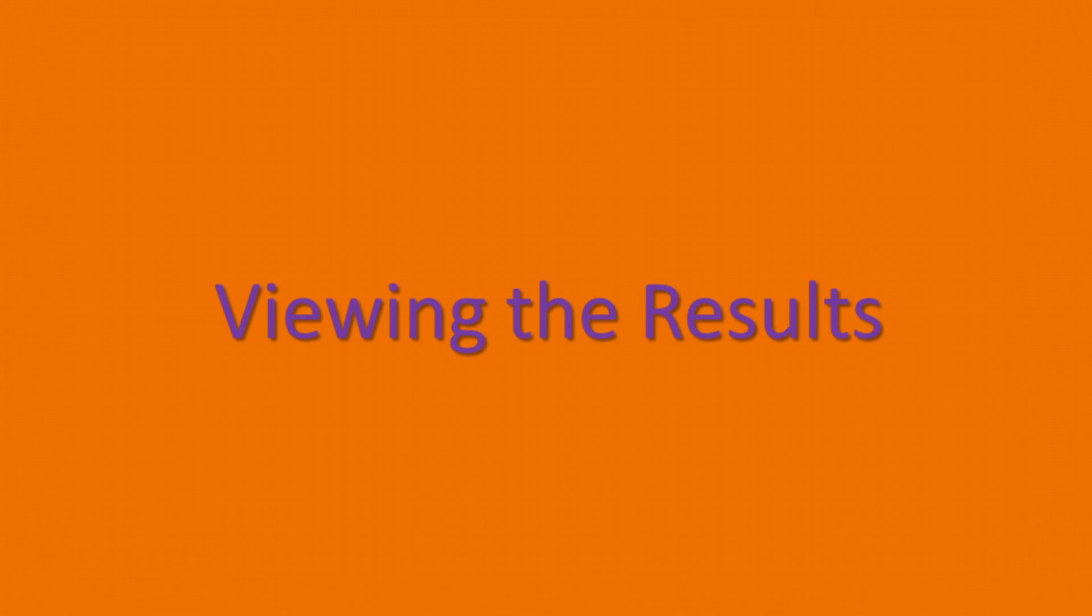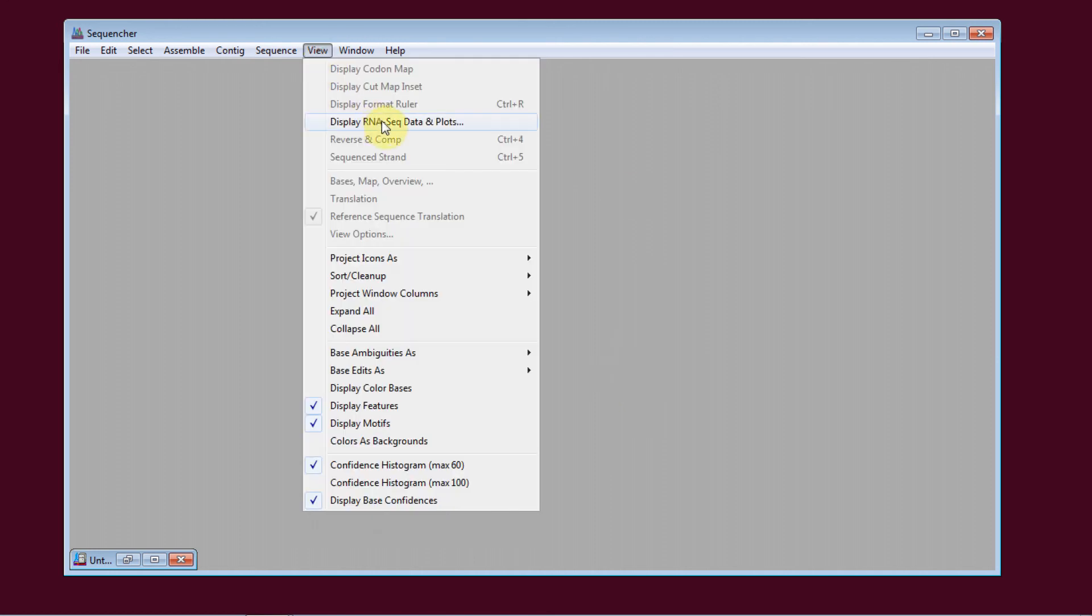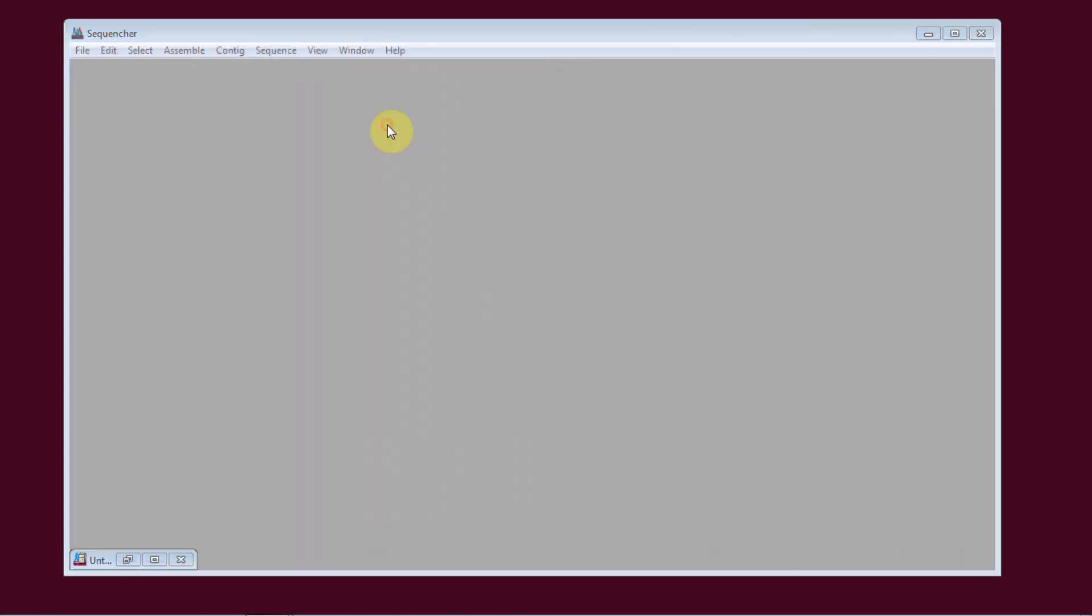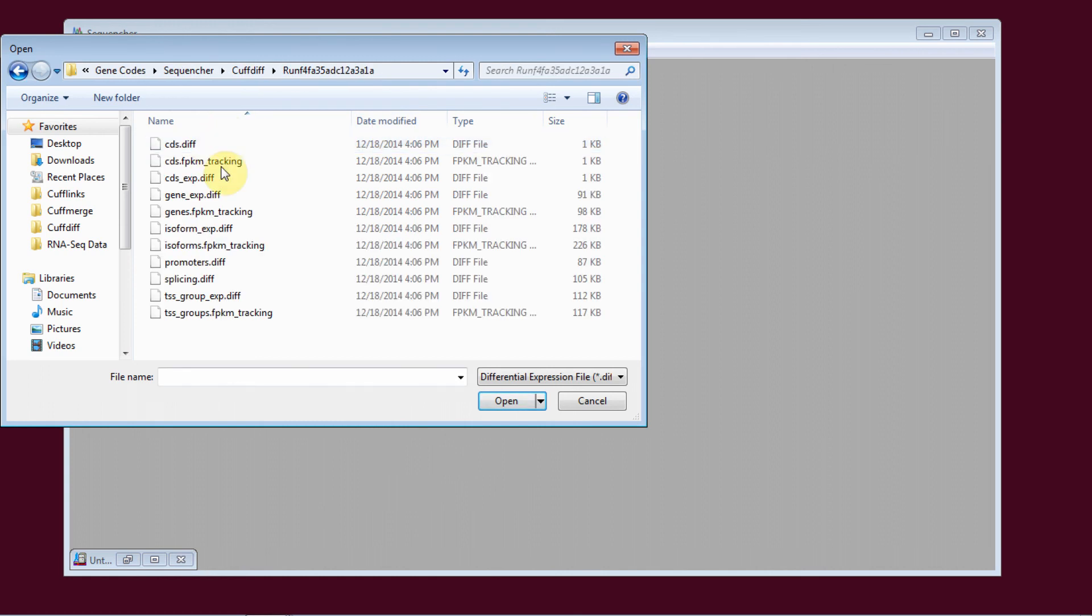The fourth step is to view the results. Sequenture has a number of visualization tools that allow you to view your results without having to use the command line. I go to View, Display RNA-seq data and plots, and then select the data that I'm interested in viewing.